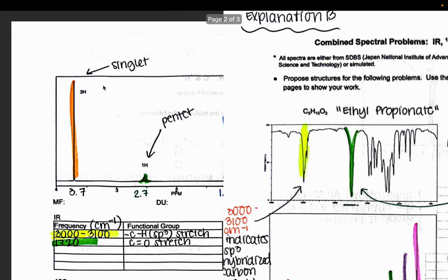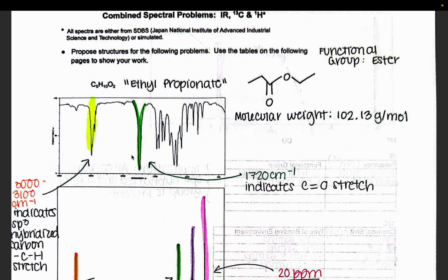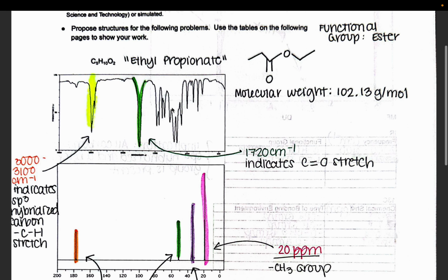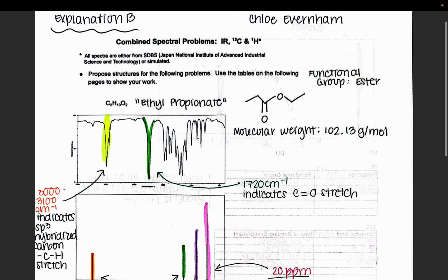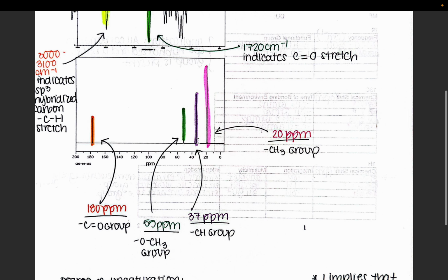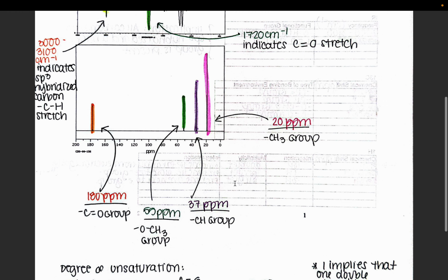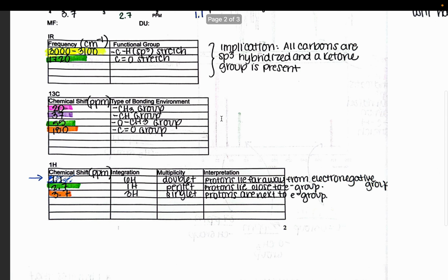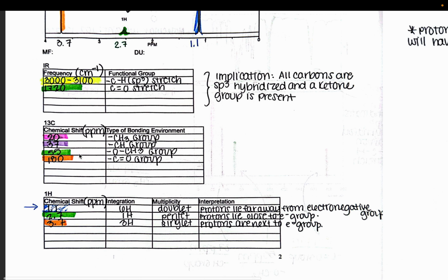Sorry. So we basically go down to our 13C NMR. Oh, a little bit of technical difficulties. I couldn't get my camera to work, so we're working with this. There we go. Okay, so we're looking here. We'll see on the next page that we have our tables filled out. This is our IR spectroscopy, and then we're now looking at the 13C NMR.